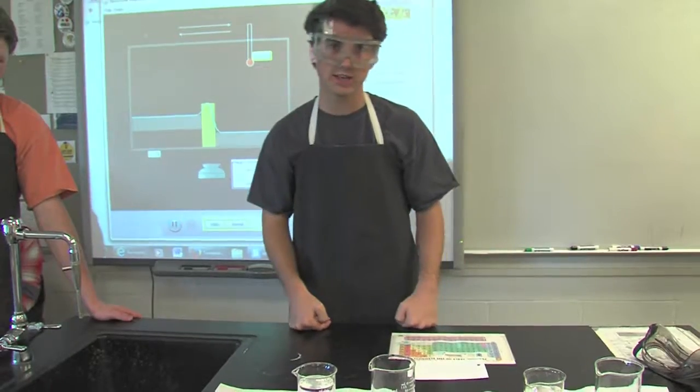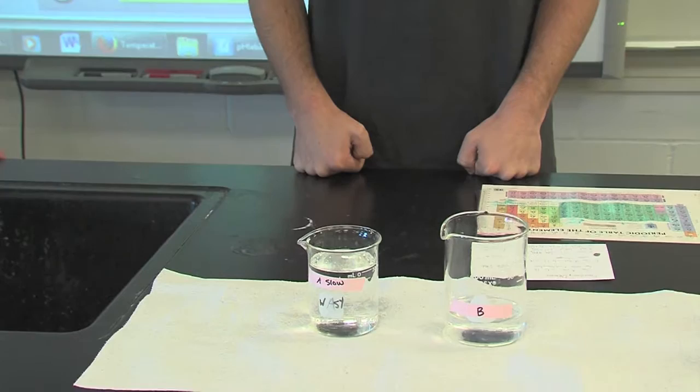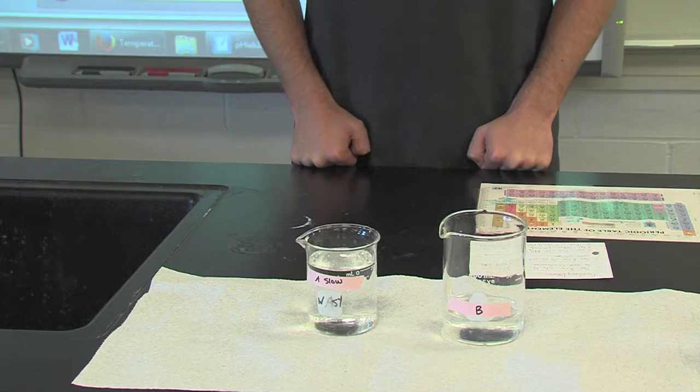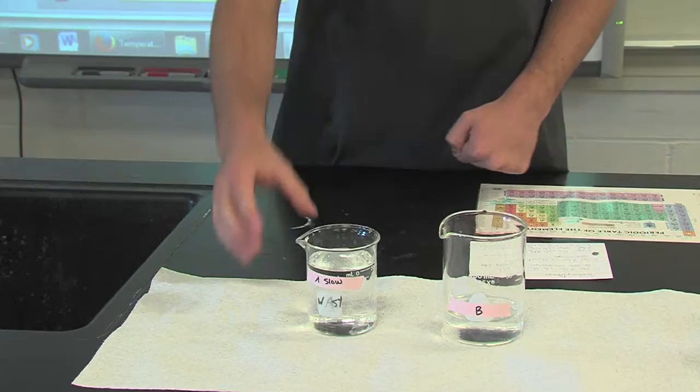This is the iodine clock. In this beaker I have 25 milliliters of 0.2 molar potassium iodate and 175 milliliters of distilled water. In this beaker we have 10 milliliters of 0.2 molar sodium metabisulfite, 30 milliliters of 2% starch, and 40 milliliters of H2O. I'm going to add it.